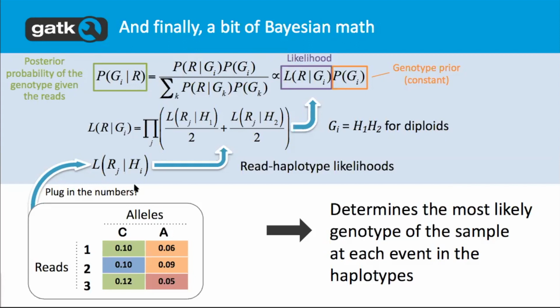Yeah, we don't have any recommendations for dealing with that in general. We kind of assume that the mapper puts things in either one region or the other. We don't do any particular processing for that. That would be interesting to look at, but I don't have an answer for you. That would be interesting to talk about with one of the developers who knows the model more deeply, to be honest.